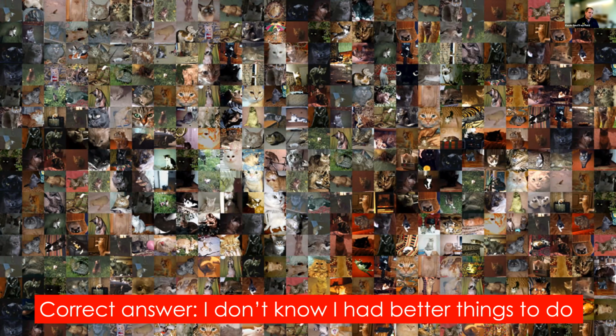And so this little game hopefully shows you that when you start thinking about in situ data, you have an inherent frame-by-frame, like even in a single frame, there's a scale issue. But then as you multiply the number of frames or how long your experiment is, this quantification that I showed for that previous paper that we did is really laborious, right? And so as a graduate student, I wouldn't want to do that many times. As a faculty member, I would feel bad, but I would still make you count all of those, right, in a long time.